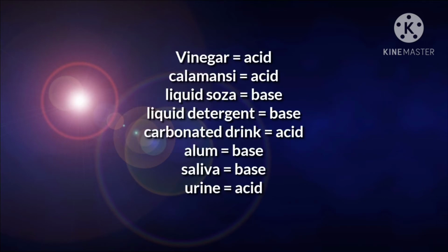In conclusion, the vinegar is acid, calamansi acid, liquid soda base, liquid detergent base, carbonated drink acid, alum base, saliva base, and urine acid.